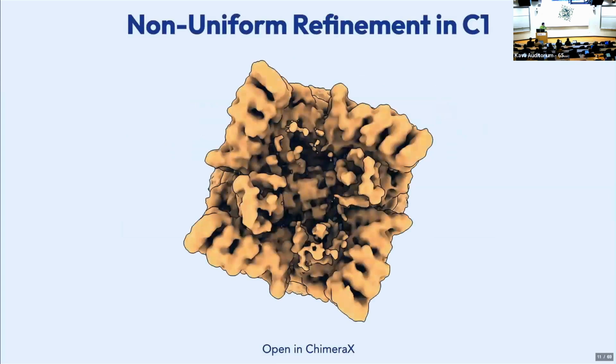Here's the result. So it's better, right? Now, instead of four equally strong calmodulins, we kind of have two that are equally strong and two that are kind of half strong, okay? This happens because as we were aligning these particles, we are no longer forcing them to go into all four symmetry-related poses. We're only using them in the pose they match best. To start with, the map is identical. They're picking one of those poses at random.